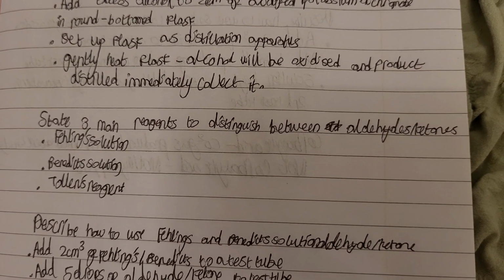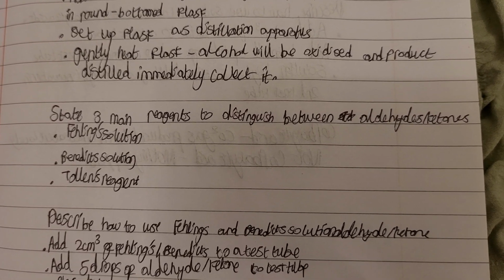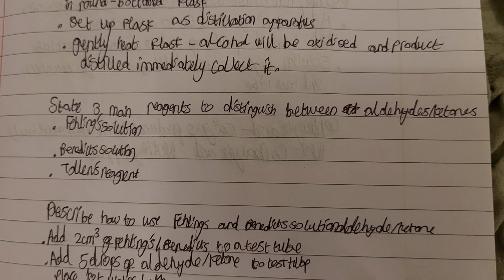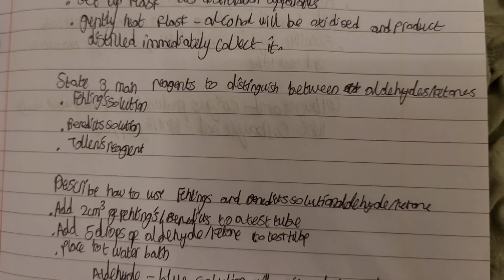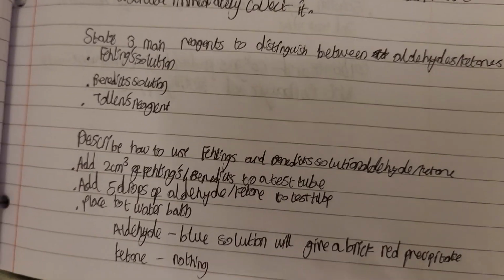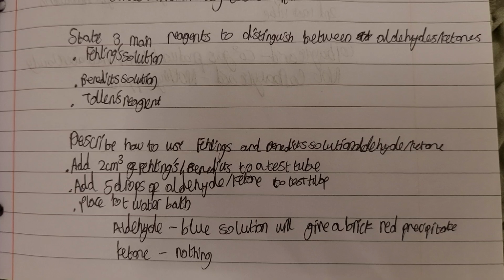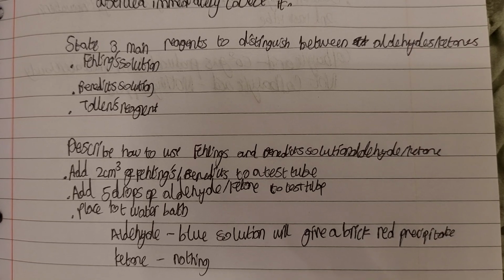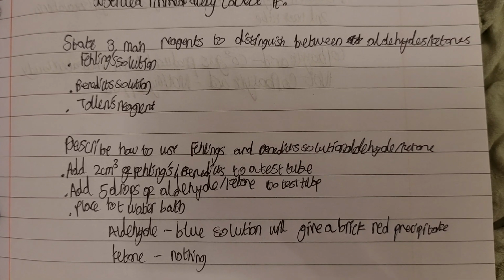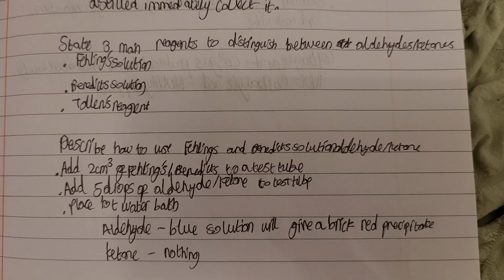State three main reagents to distinguish between aldehydes and ketones: Fehling's solution, Benedict's solution, and Tollens' reagent. Describe how to use Fehling's and Benedict's solution to distinguish between an aldehyde and a ketone. Add 2 centimeters cubed of Fehling's or Benedict's solution to a test tube. Add 5 drops of the aldehyde or ketone, place in a hot water bath, gently warm the mixture, and then leave it to cool. If it's an aldehyde, the blue solution will give a brick red precipitate. However, if it's a ketone, nothing will happen.